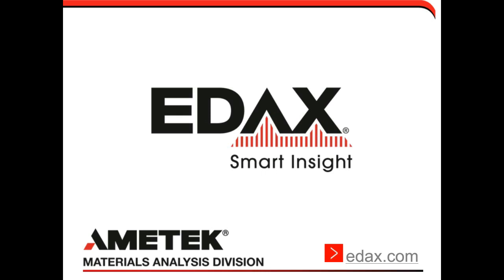Okay, so let's go to the next question. For the SMX ILH, what is the highest temperature which can be handled? So the heat shield in the ILH system works up to about 300 degrees Celsius. And what it basically does is help to dissipate the heat emanating off of the sample so that temperature fluctuations don't affect the detector and electronics technology.